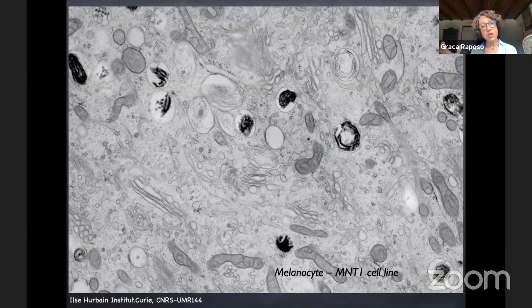And the volume of the organelles is also maintained, because what the aldehydes do, and also because you dehydrate with ethanol, is cause shrinkage of the organelle. Here we maintain the volume, and we maintain the volume of the Golgi stacks, for example. It's very nicely preserved, including the cytoskeleton and all the vesicular components.